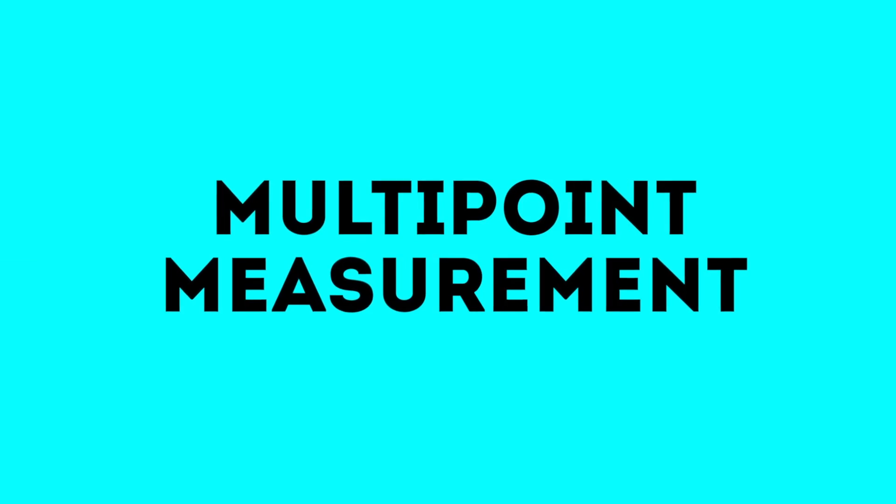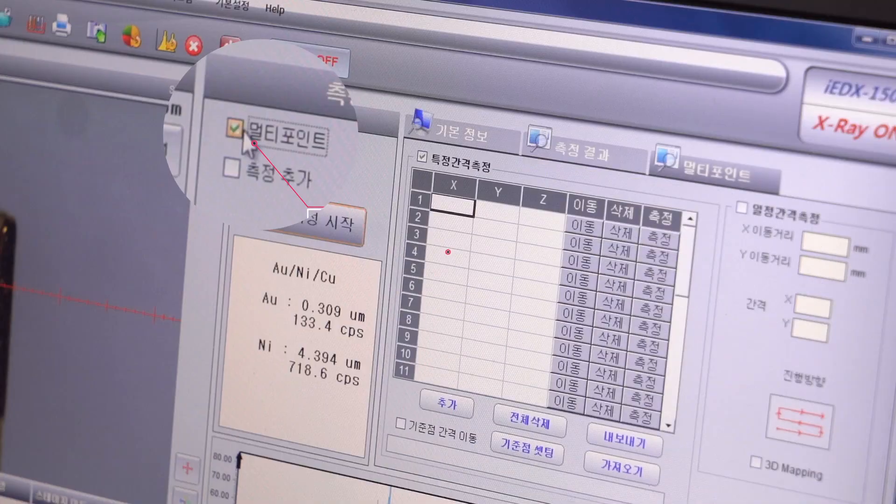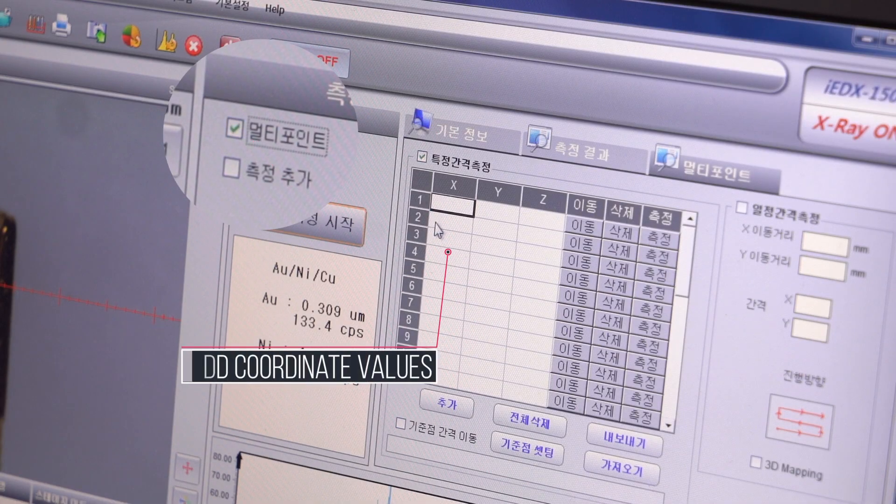Multipoint measurement. Check multipoint. The coordinate value input window appears.